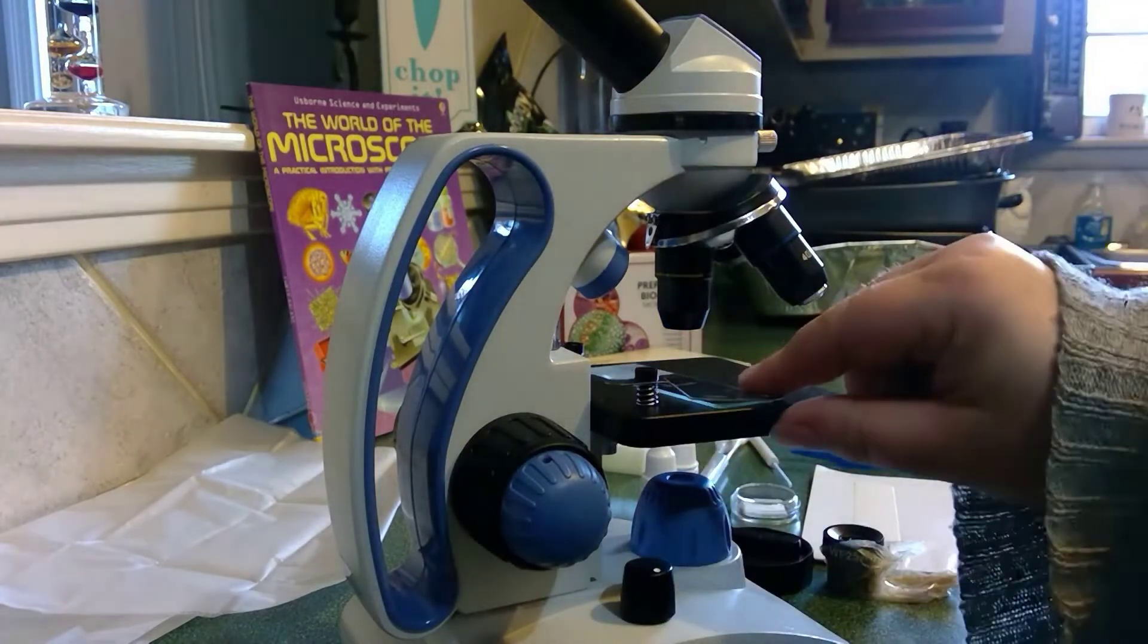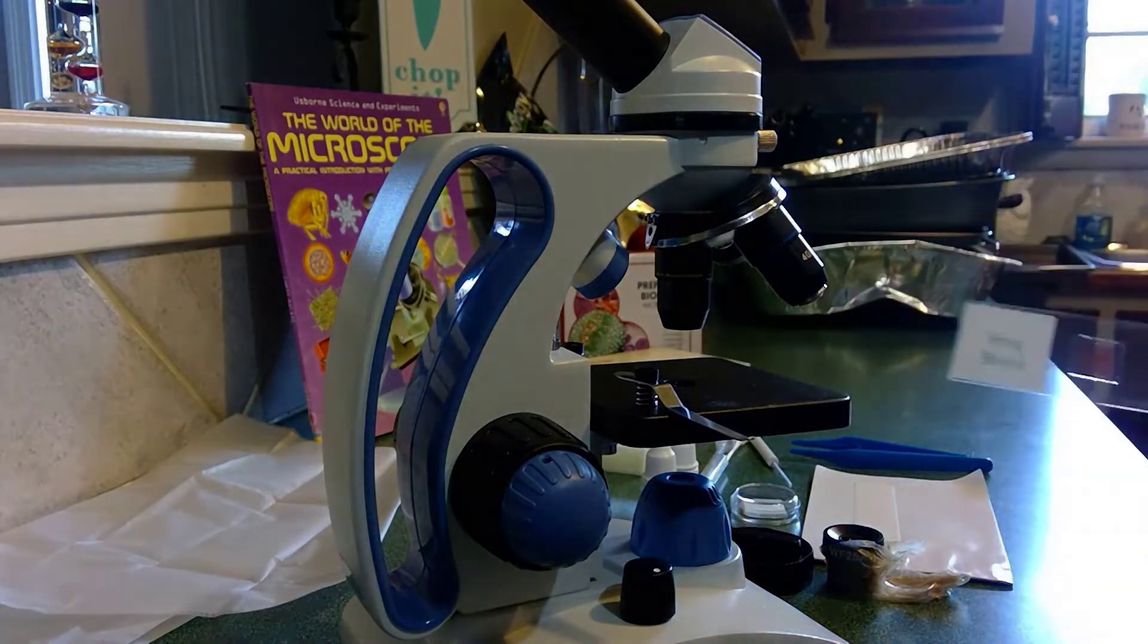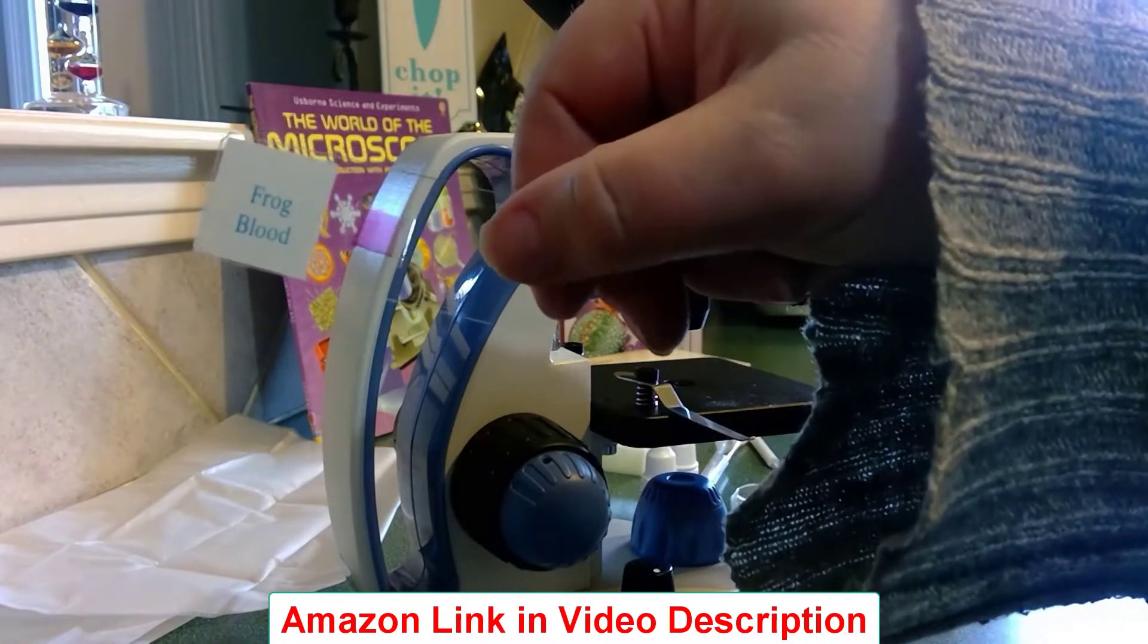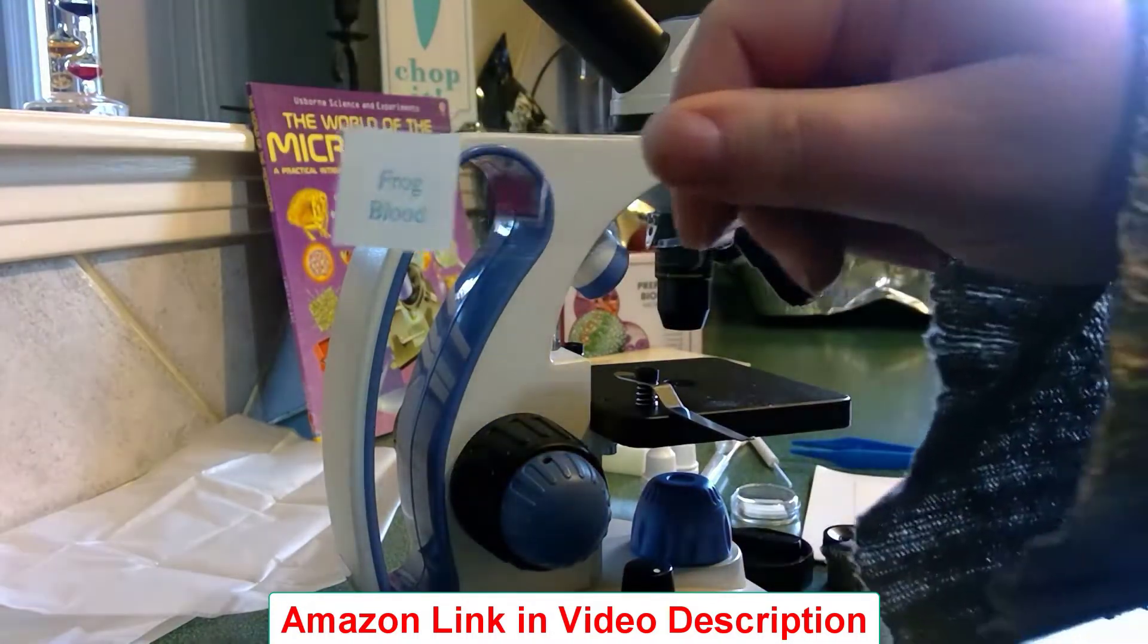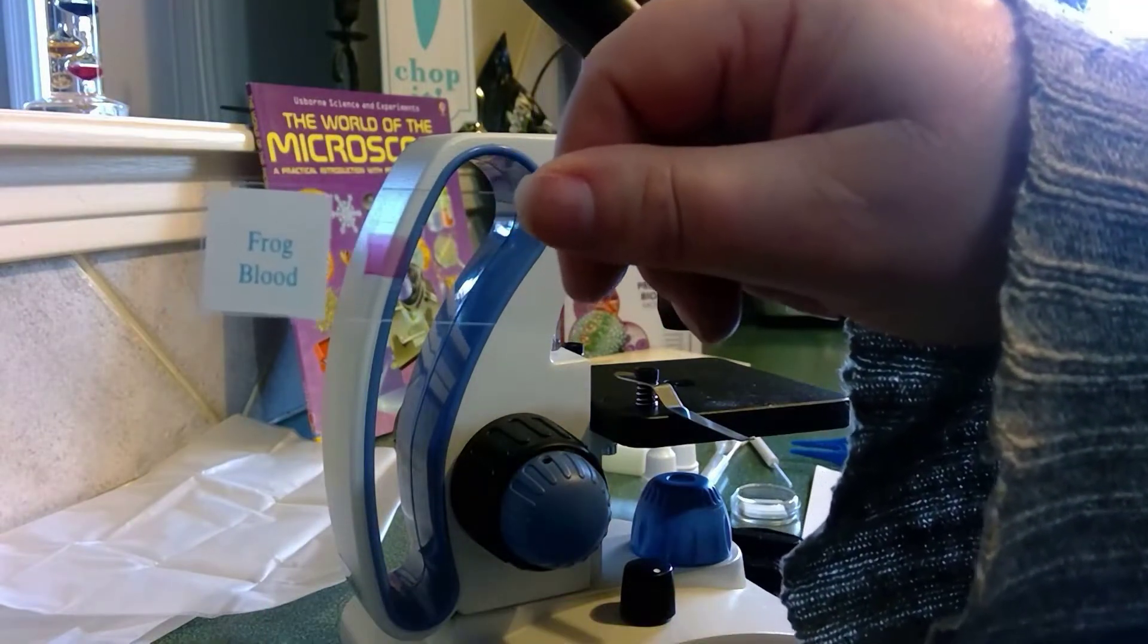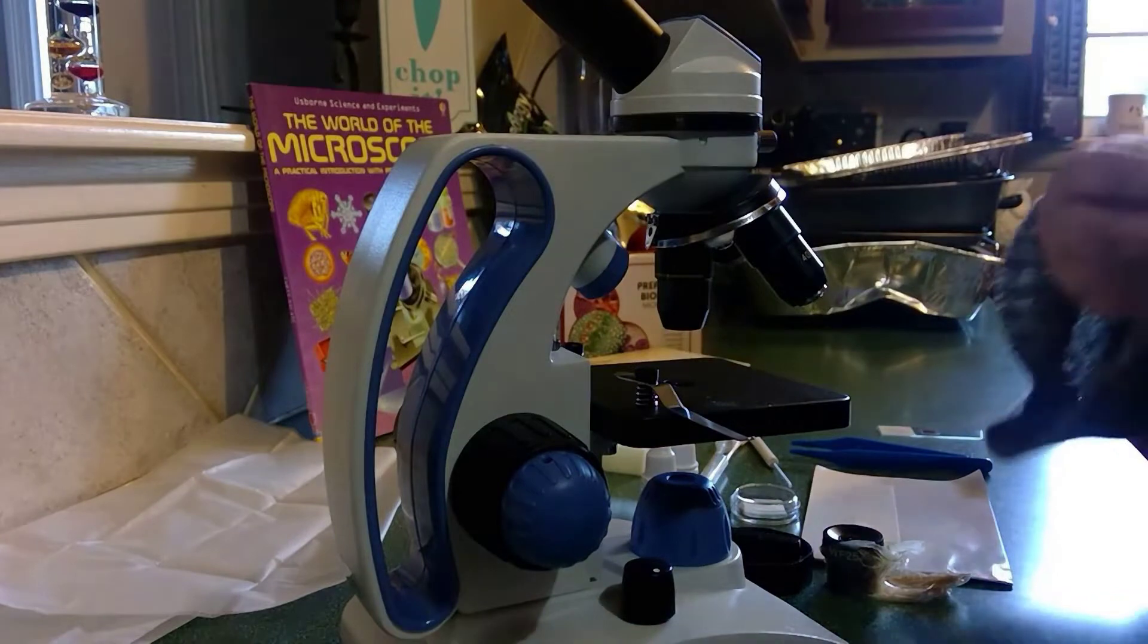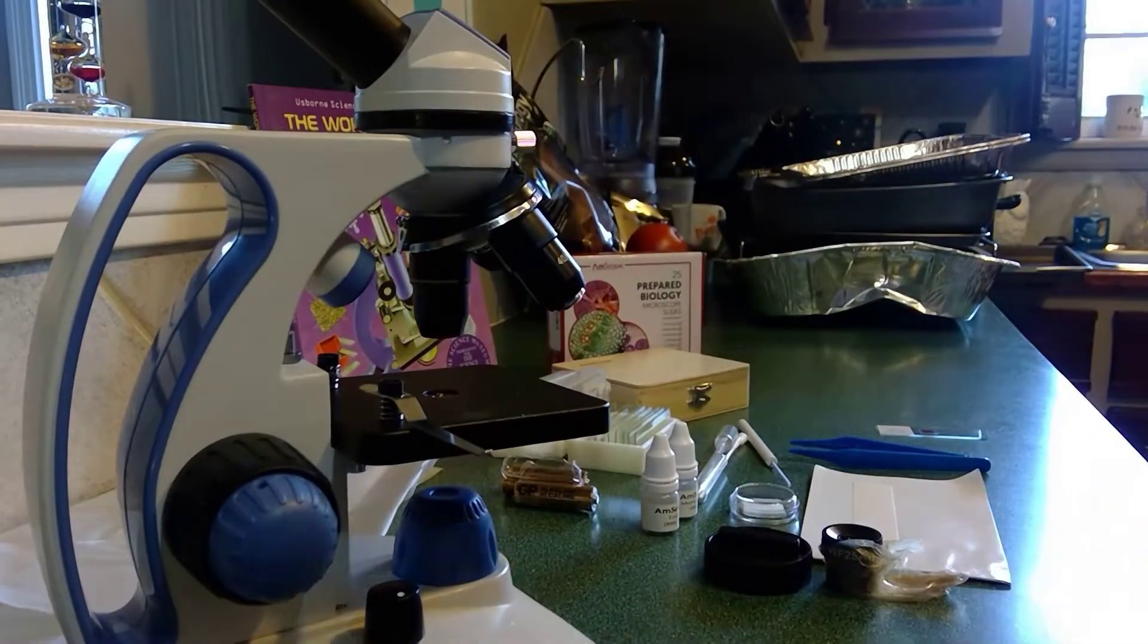So let me just show you some of the things that it comes with. There was already on there a slide that came with the kit. This is a slide of frog blood, which my girls had a fun time with, but also my youngest didn't like it very much because the idea of it coming from a frog and that a frog was hurt was not very fun for her to think about. But that was just part of the slide set that came with it.